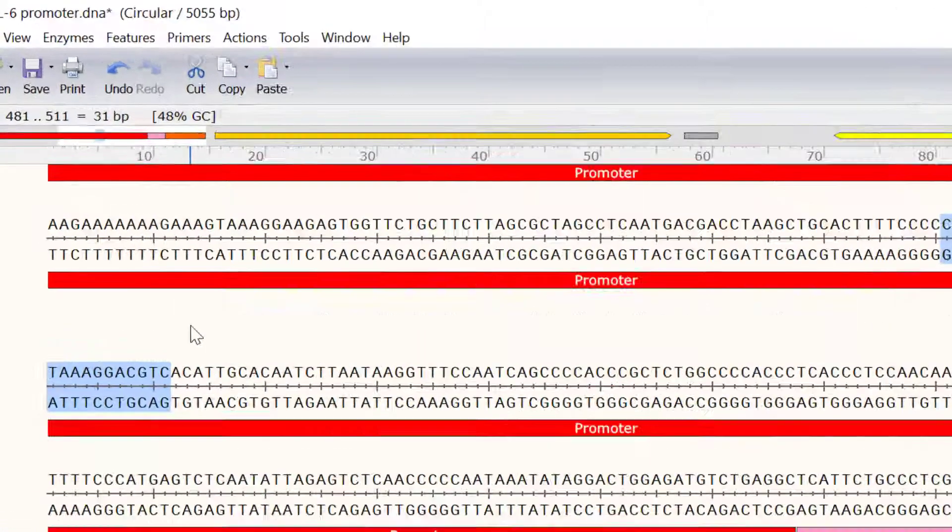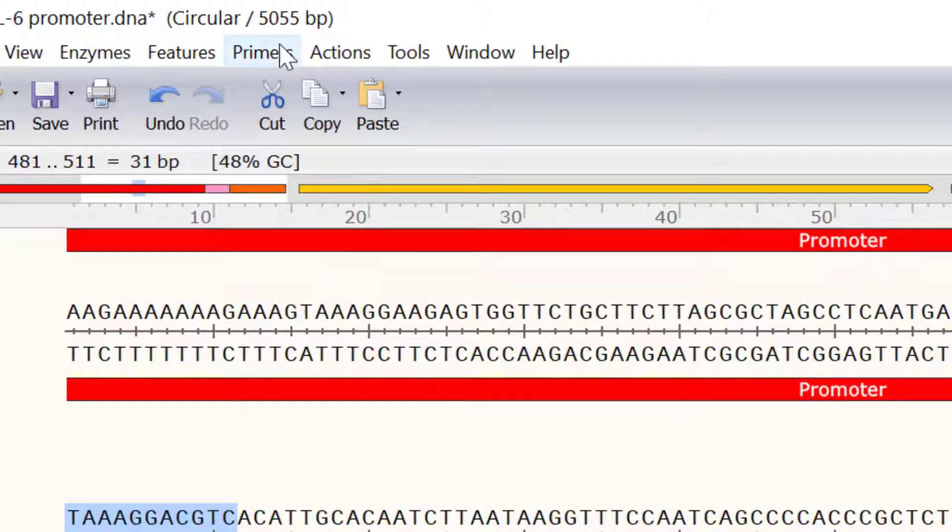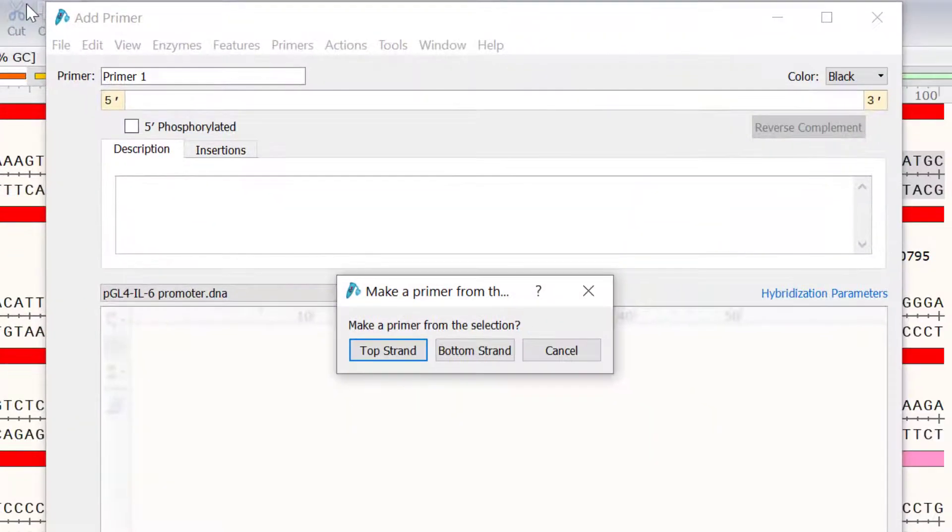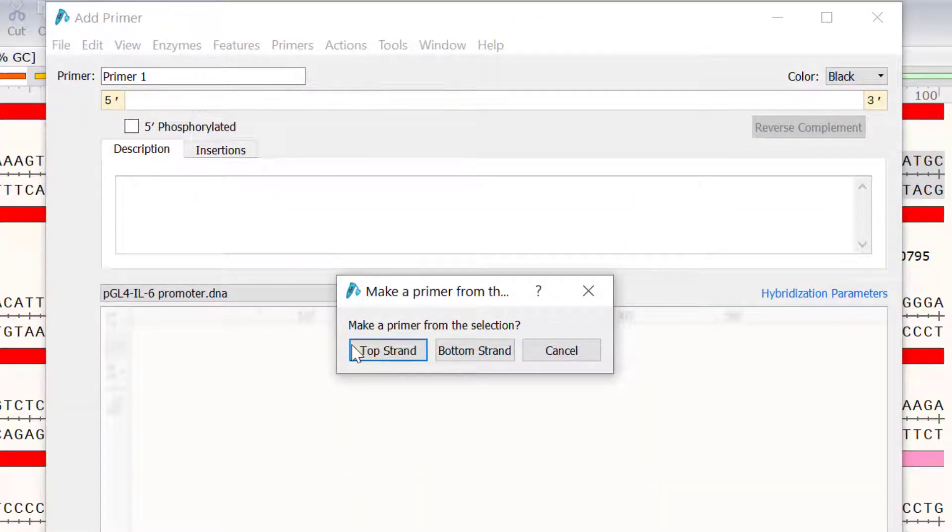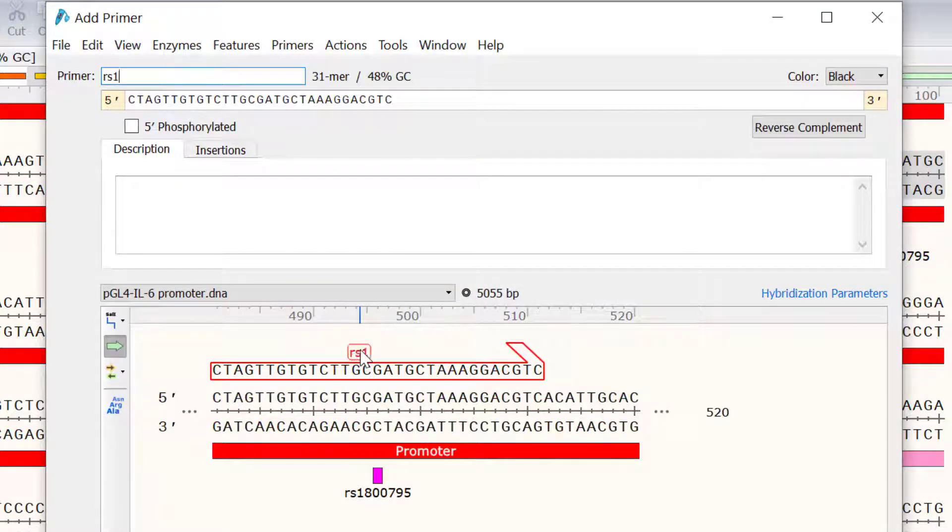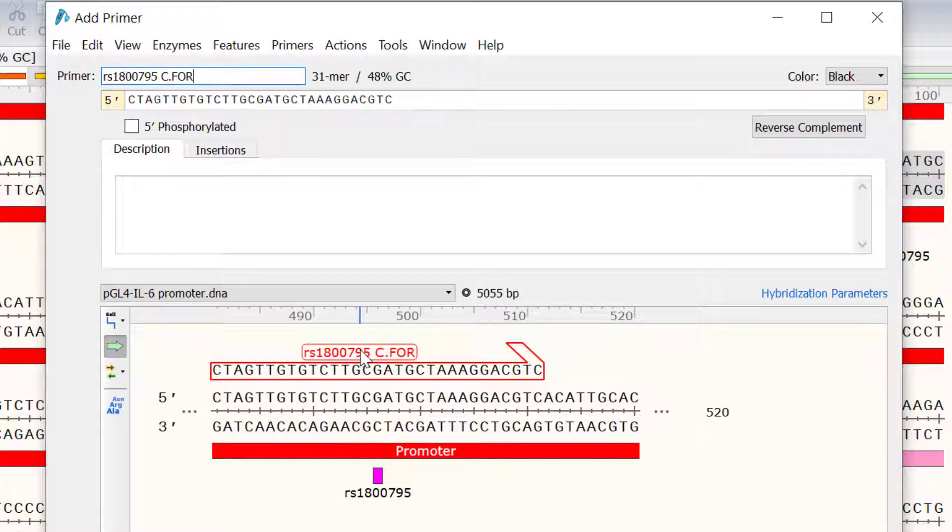Next, I will create a new primer by going to Primers, Add Primer. And for this example, I will select to make a primer using the top strand first. I will call this primer RS1800795 C.4.